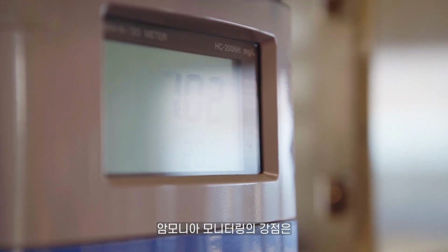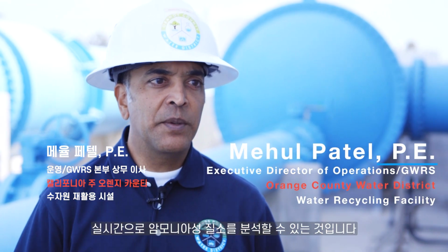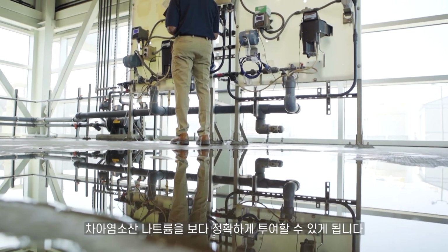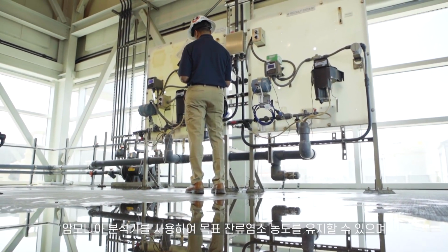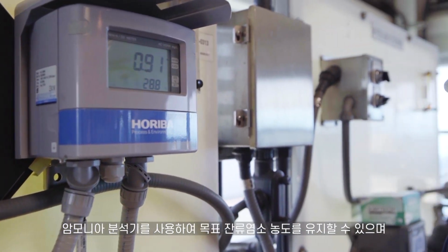So there's a great benefit to us to have ammonia nitrogen or ammonia monitoring with the online ammonia analyzer. What it allows us to do is to determine the background level of ammonia, and that helps us to more accurately dose our sodium hypochlorite or our chlorine to maintain our target chloramine residual.